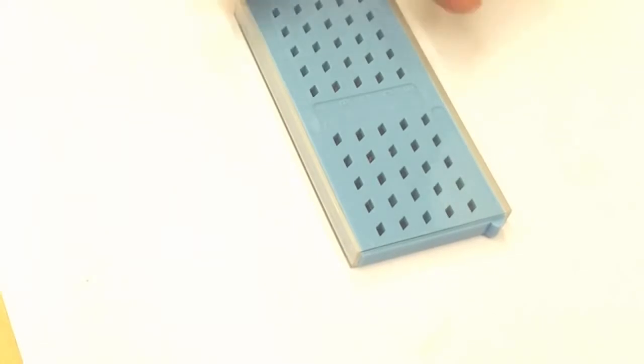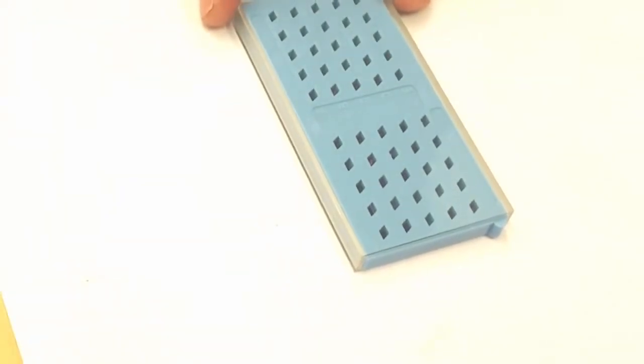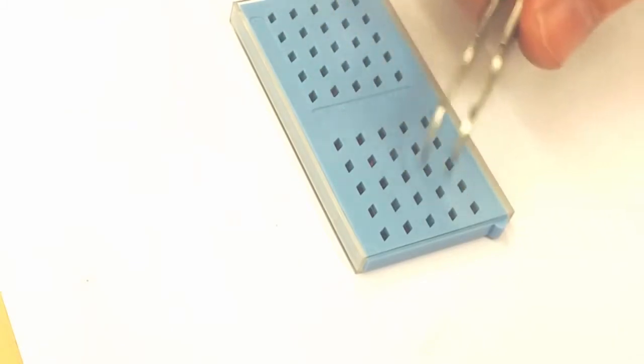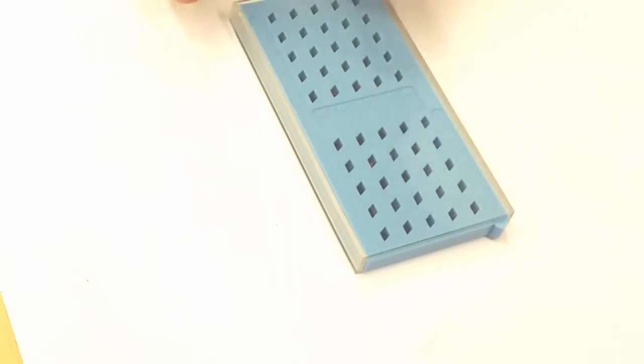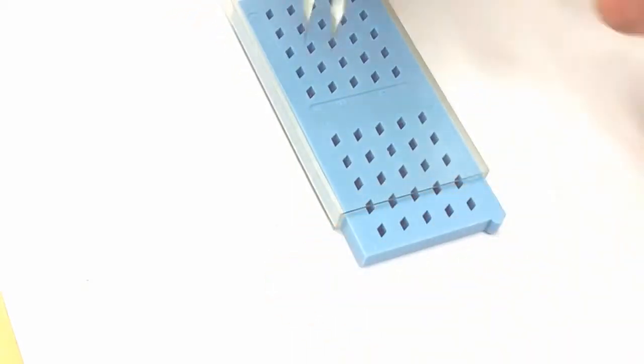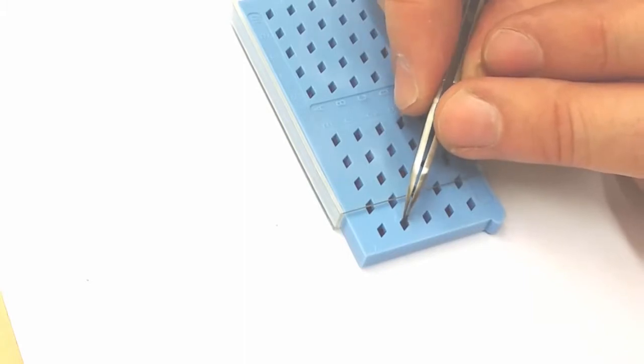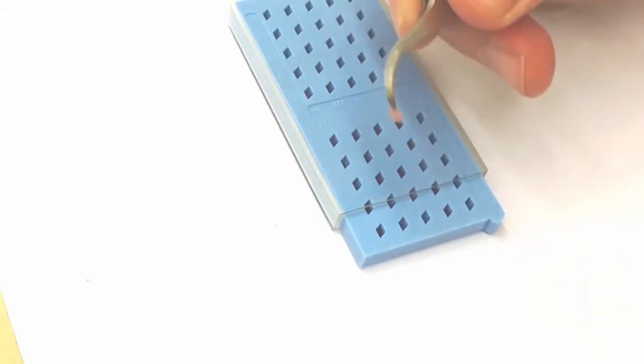When you do TEM analysis, you usually put your samples on small metallic grids. And these grids you buy, and they usually come in a box that looks like this. So here you have several small holes, and in each hole there is one of these small metallic grids. If you open the box, then you can pick up one of these, and then you can see that it looks sort of like this.